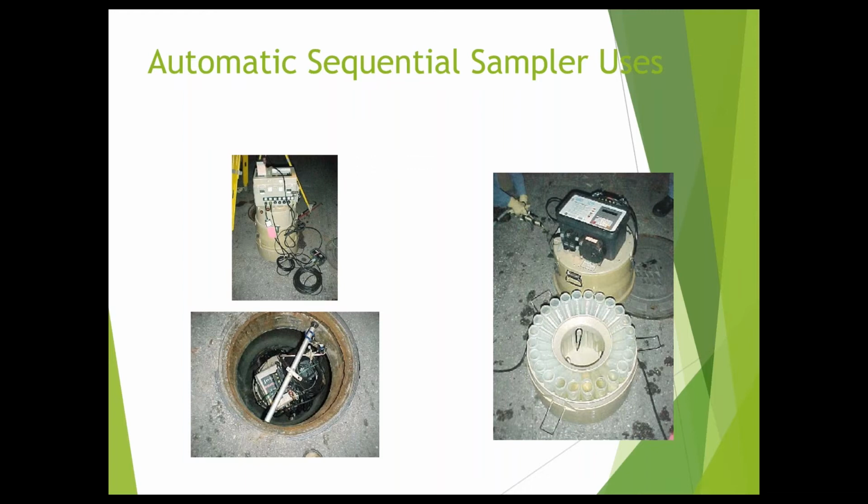So here we wanted to know what was going on at a specific point in time, and we use this. And I don't know about you, I've been in a manhole before. It's not very comfortable, and I would rather not spend overnight in a manhole. So we put the sampler down there that did the work for us.